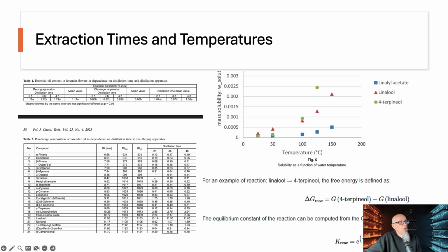I mean, if we don't want the terpenol, we can go up to that, but if we're trying to isolate just the linalyl acetate, then we could potentially go up to 150 and then cut the linalool out. But for what we're doing here, we'll go 100 degrees Celsius and just call it a day.